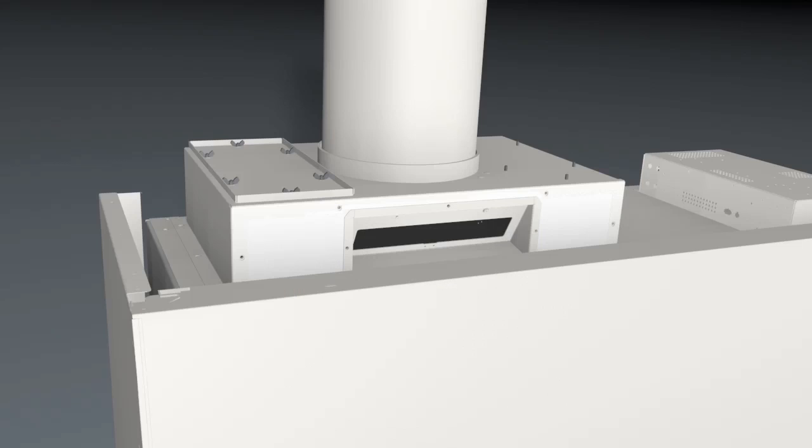Here you will find the exhaust bypass and cover plate, the inlet pressure relief valve, and a 10-inch round exhaust duct collar.